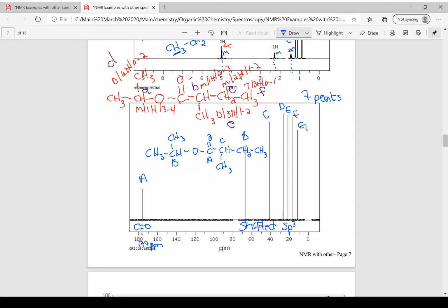Well, let's take a stab at it. I think closer to the oxygen should be the next one. So A, B, C, so D. So I believe these are going to be D, and then E. And now, as odd as this is, the G is the smallest. The G is the smallest. So I'm actually going to change this to G, and then I'm going to change this one to E, and that one to F, only because I went on height. Now remember, never go on height unless it's a tiebreaker, and for all 4 of those, I didn't know where they fell, so I used it as a tiebreaker.